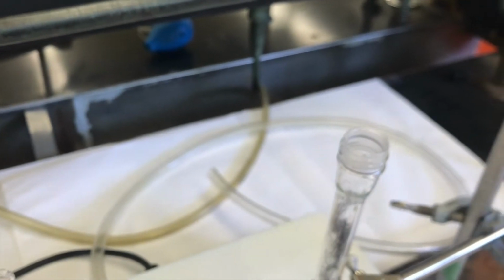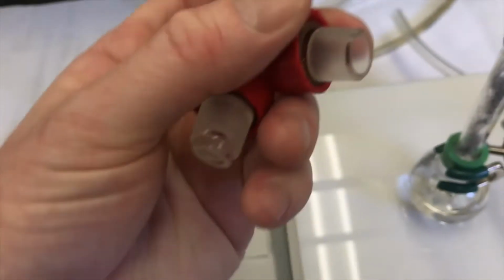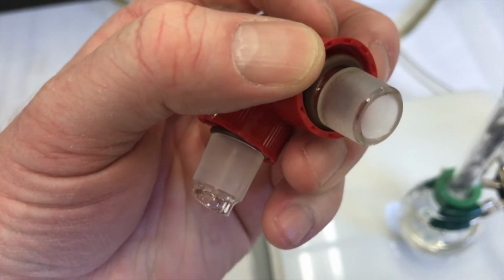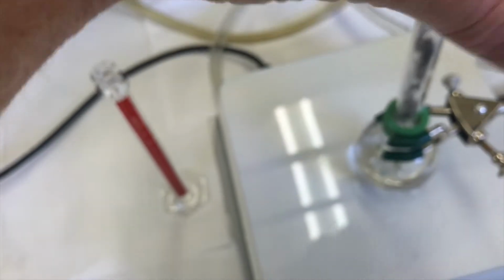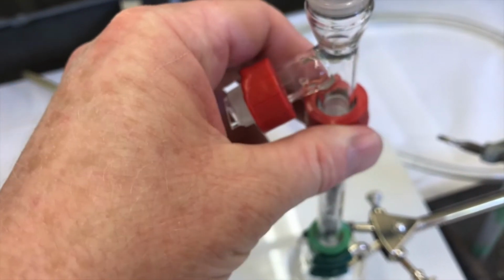Next, I need a distillation head. So that's this guy, and I didn't talk about this earlier. These have an O-ring in there. It's that brown O-ring. When I go over here and I tighten this red cap, it pinches the O-ring and it helps it to hold together, grab onto each other.